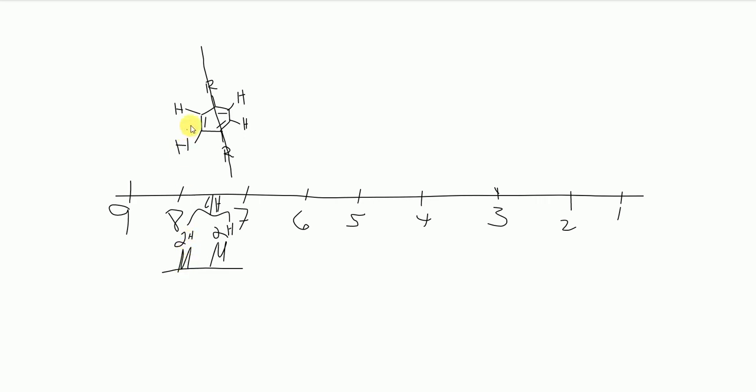and it's only bonded to one hydrogen. And so the multiplicity value is only from being bonded to 1 hydrogen over here. So the integration number is 2 because this peak corresponds to two locations. So 2 hydrogens are represented by the peak, and the multiplicity value is only respective to this other hydrogen here. Because it's symmetric, it's only 1 plus 1. You don't really need to understand this, but it's nice to know when it makes sense. So this is 2, and this is why this is a doublet.